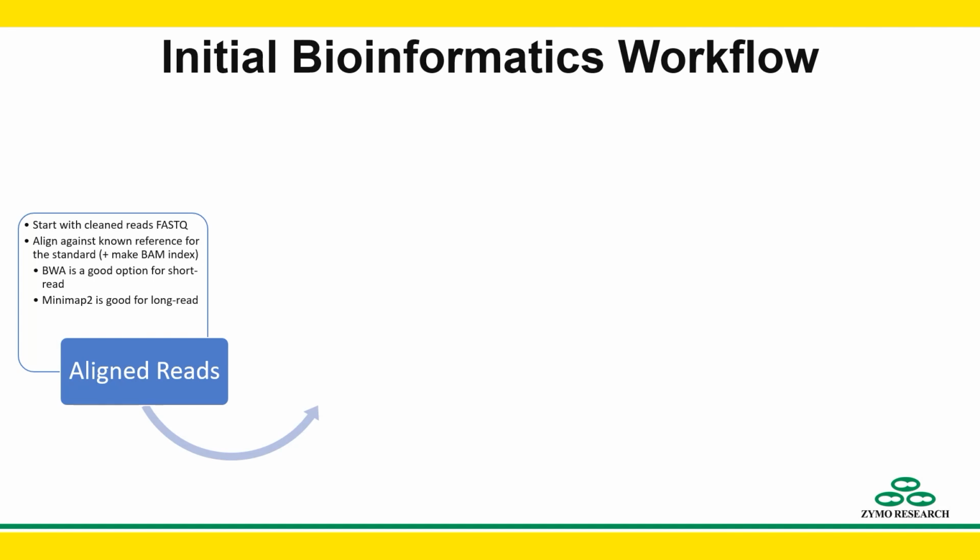and this is where things differ a little bit from what you would typically expect. Typically, with microbiome, you want to do taxonomic assignment, but for these reference materials, you typically have reference genomes. These are genomes that are known and well assembled for microbes that are known to be in your reference sample. So in this case, an alignment-based pipeline is a really good place to start.